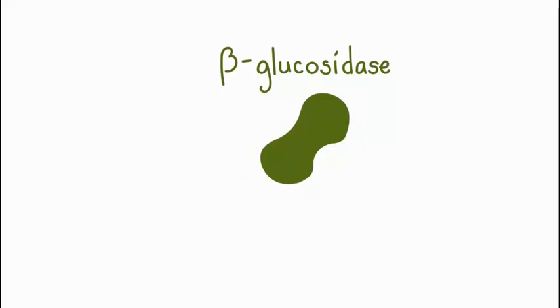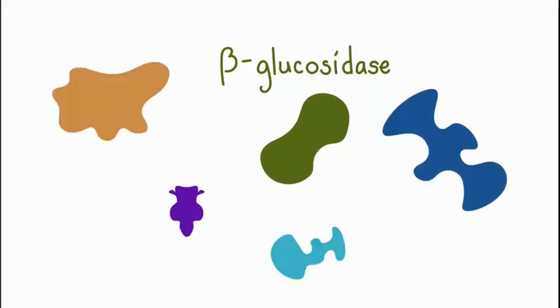But how do you tell how much purified active enzyme you need and how much you have? If your enzyme isn't purified enough, you might have less active enzyme than you think. And how do you fix your purification method if it's not working well enough? Where would you even start?